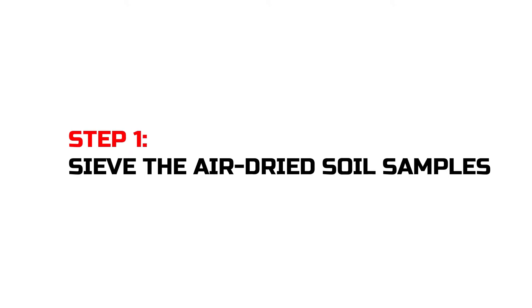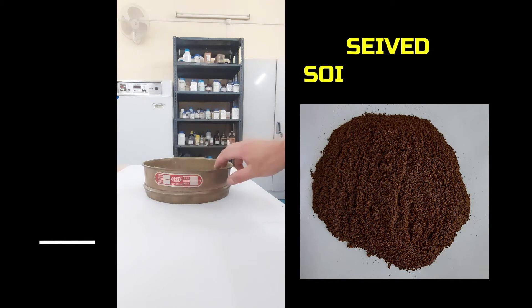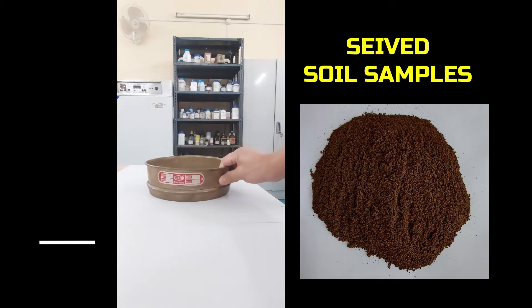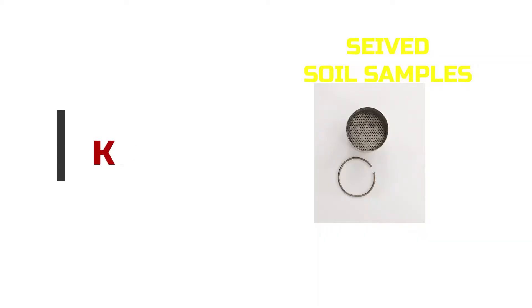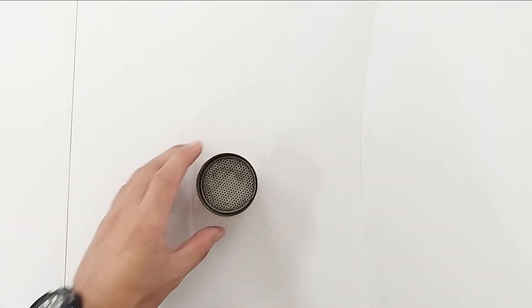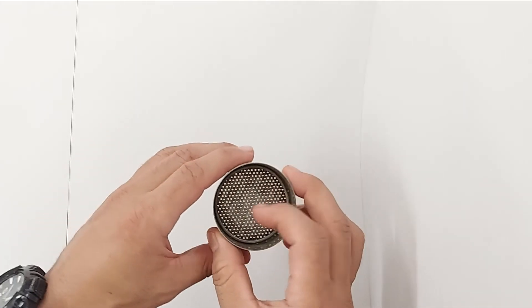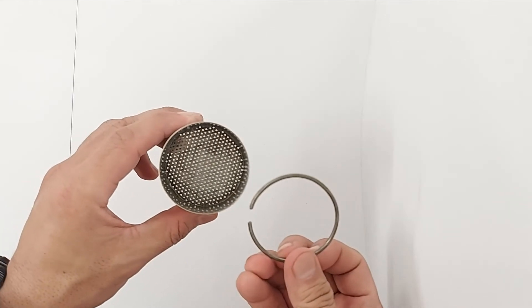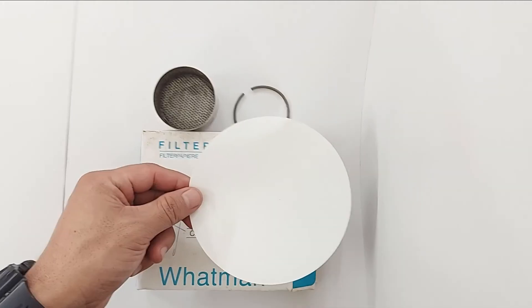For estimation of water holding capacity, the soil sample must first be passed through a 0.5 mm sieve. The sieved soil sample is then filled into the Keen Box. Let's first see how a Keen Box looks: it is a circular box with a perforated bottom and a ring inside whose purpose is to hold the filter paper. The next step is to place an appropriate size filter paper into the Keen Box.